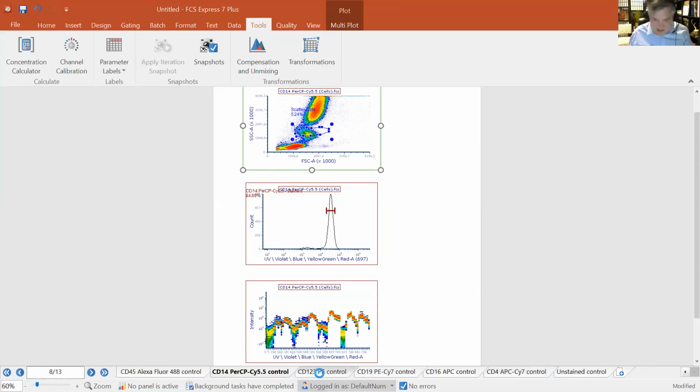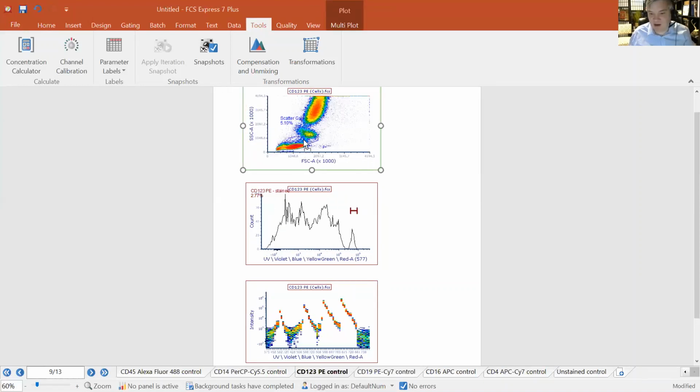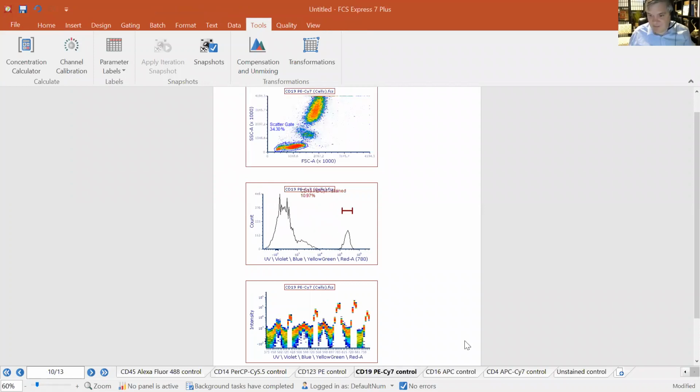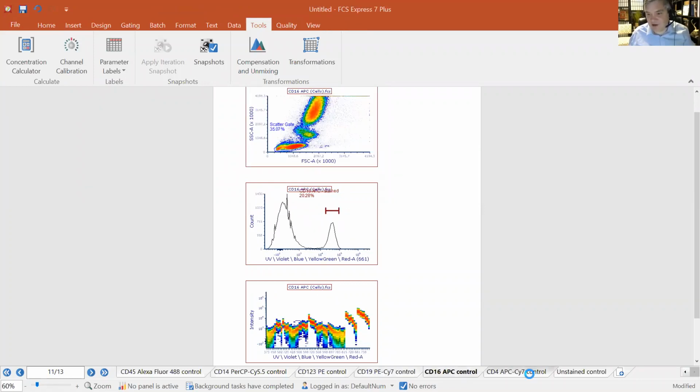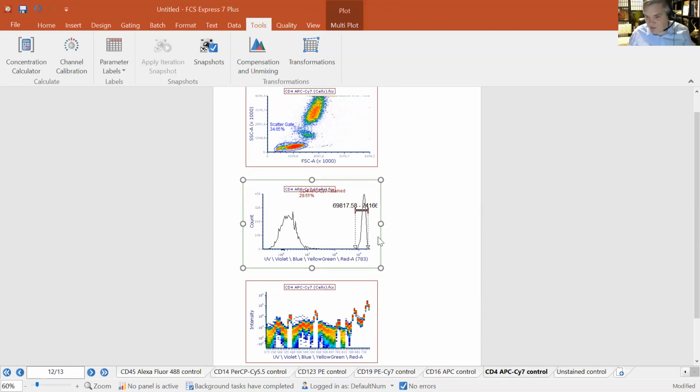And again, with this unmixing data, I've got a lot more parameters, so I've got to do a few more pages of work here. But again, we make it pretty straightforward. I kind of come in, find out where that peak is, go through everything here. This is the kind of boring part of doing it, but we'll just adjust our peaks.